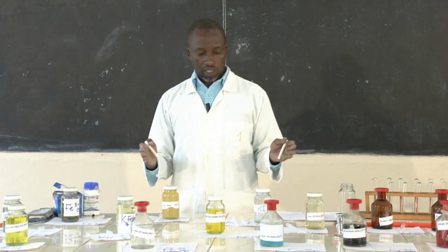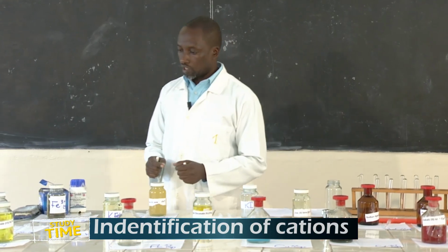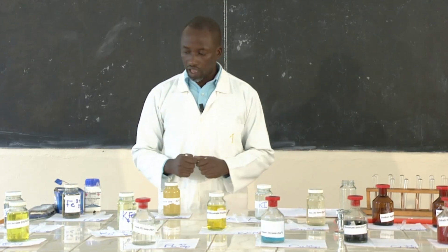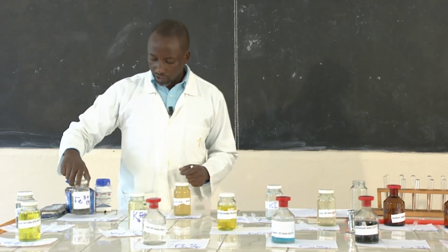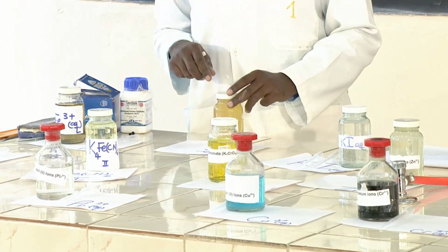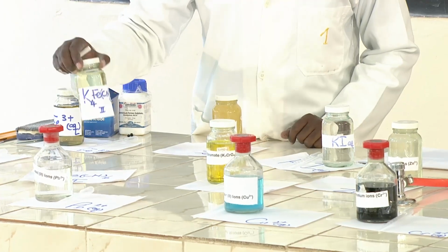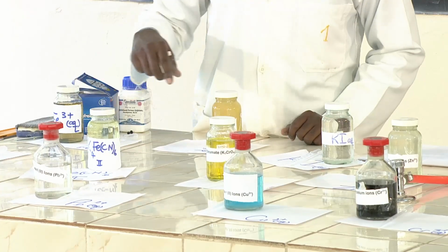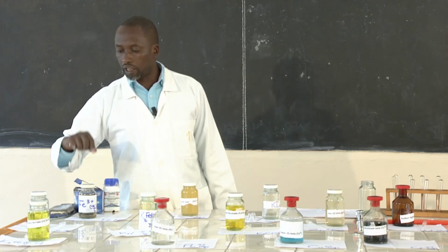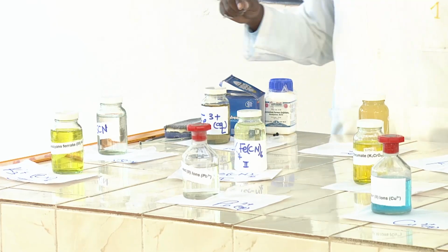Basically, in these practicals, I just wanted to take you through the number of ions, the number of cations that we have here. We have iron 3 ions, iron 2 ions, a solution of potassium iodide, a solution of potassium hexacyanoferrate 2, a solution of potassium thiocyanide, and a solution of potassium hexacyanoferrate 3.